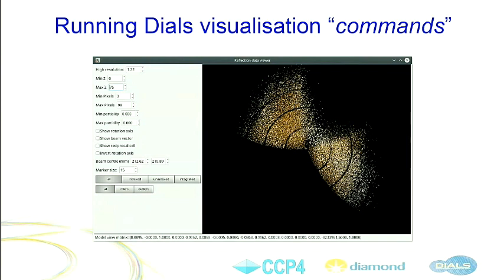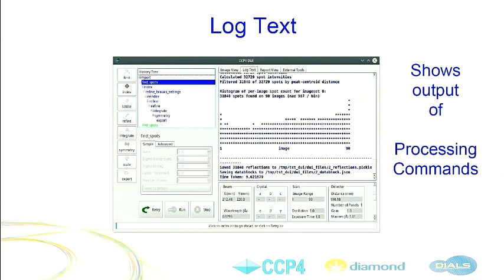It's a nice tool for seeing anomalies. For example, if your beam center in the header of your file is wrong, the Reciprocal Lattice Viewer will show curves or bananas in your reciprocal lattice instead of aligned spots. All these features will look much better in the demo — I strongly advise you to come tomorrow to my lunchtime byte, where I will run this. There is also the log text: this is what you would see if you were running DIALS from the command line. This is the way we used to see the output of our commands before this GUI, and it's available here in Dewey.